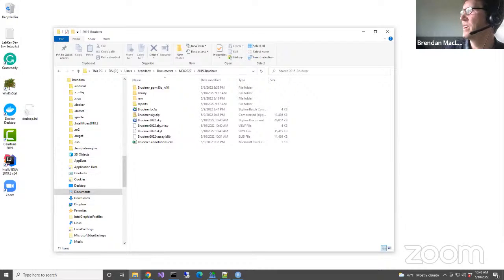How should we adjust to see, for example, only 6 best peptides for each protein? That's a good question. You would need some way of deciding what the 6 best peptides are, and so typically we would do a round of refinement, what we just talked about, and then once we had imported data, we could choose the 6 most intense peptides for each protein. That's another refinement when you have imported data. Otherwise, you would need some sort of score to differentiate them, maybe something like the Prosit team would come out with. But at this point, there's a bulk way for Skyline to say, if you've acquired 20 peptides and measured all the peptides, then you could tell Skyline to only take the 6 with the most intensity. That's the way we do it. So that's very possible.